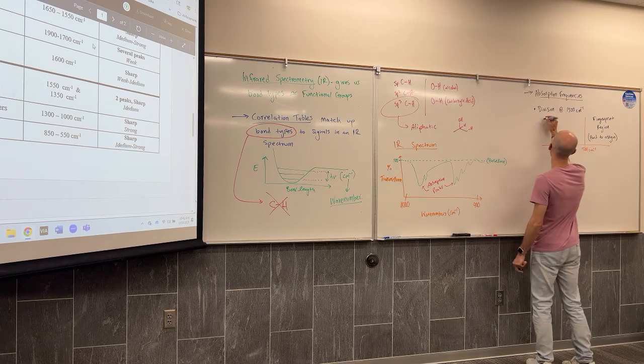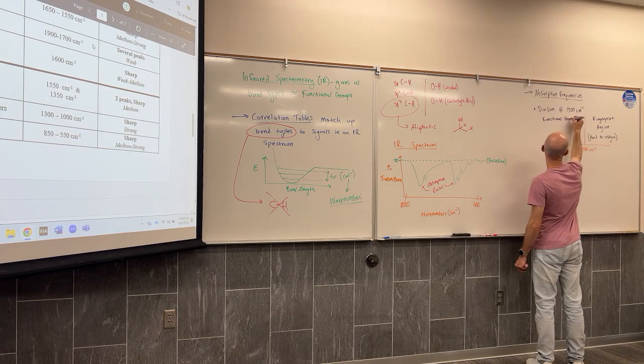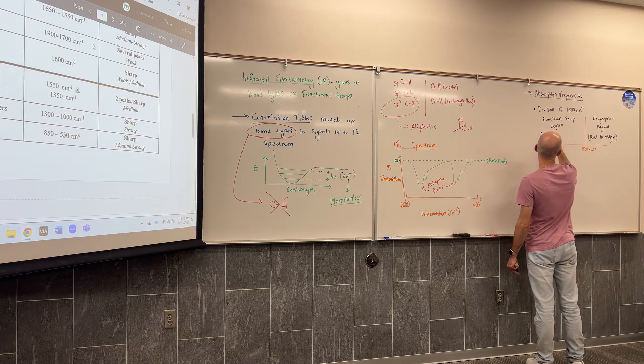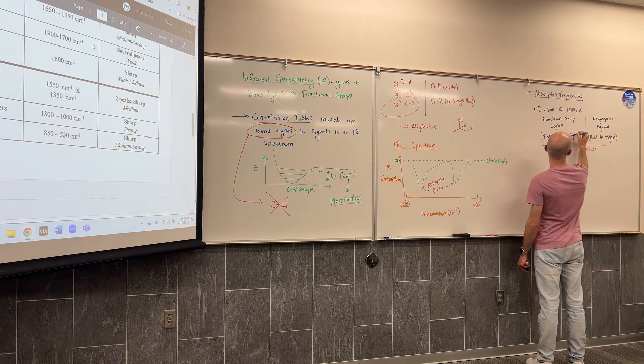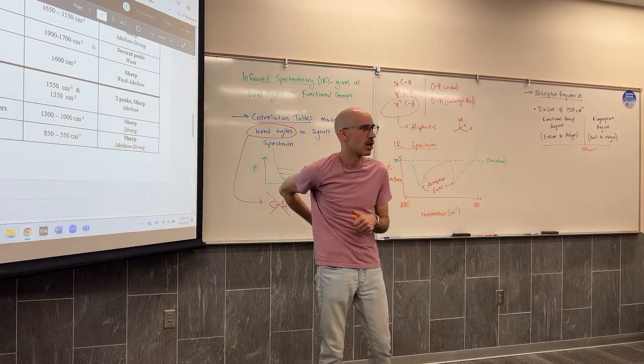The other region we call the functional region or the functional group region. Here it's easier to assign, but I'm not going to say that it is always perfect.